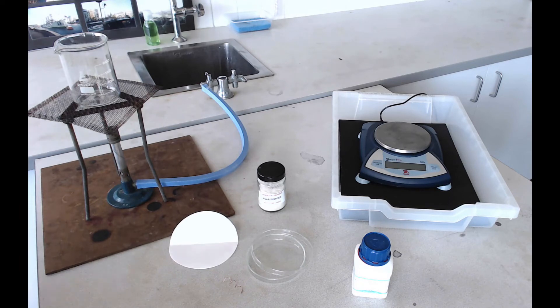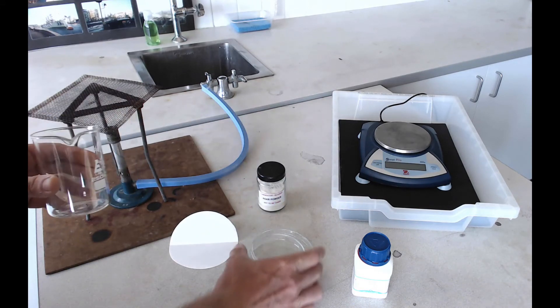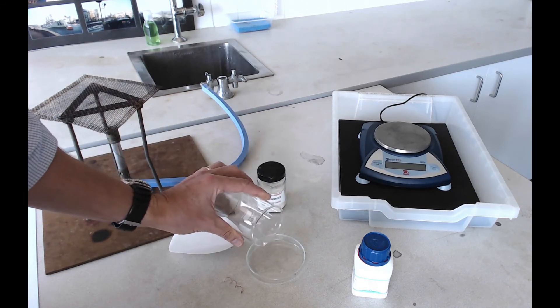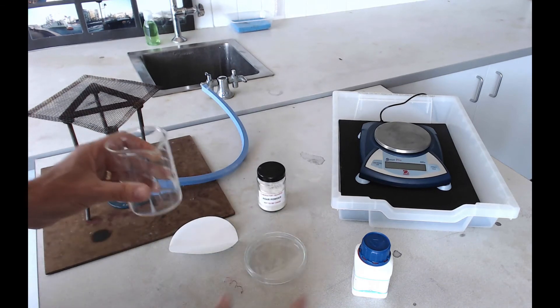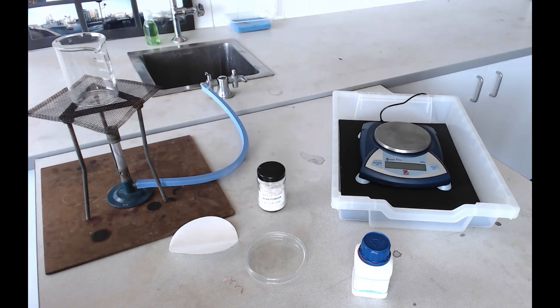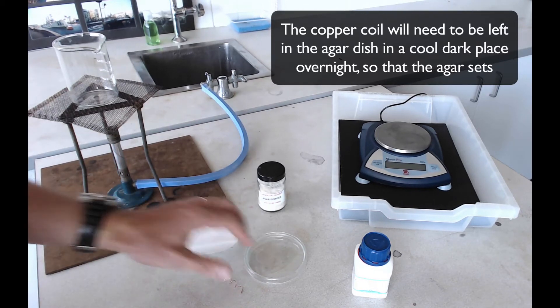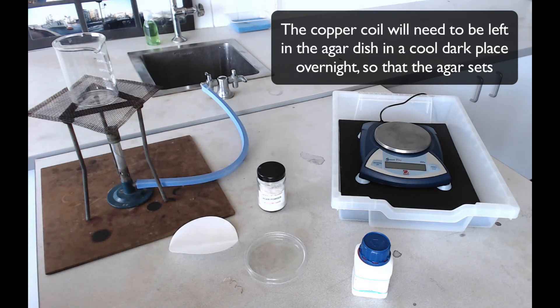Now you're nearly ready to set things up. Take this agar solution, which also has silver nitrate dissolved in it, and pour it carefully into a petri dish. Be careful not to overfill it. It's also worth thinking about where you're going to put the petri dish before you fill it, because you don't want to be walking around the whole lab when it's full of solution — it's very easy to spill. Bearing in mind that we want to leave this in a cool dark place overnight, get to that place before you pour in your agar solution. Any cupboard in the lab will do.